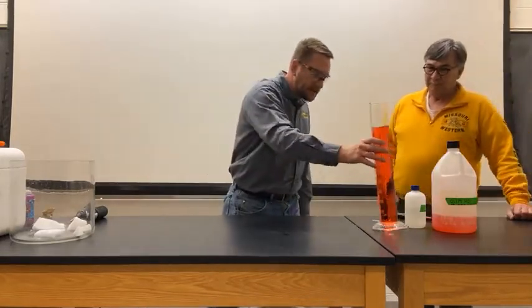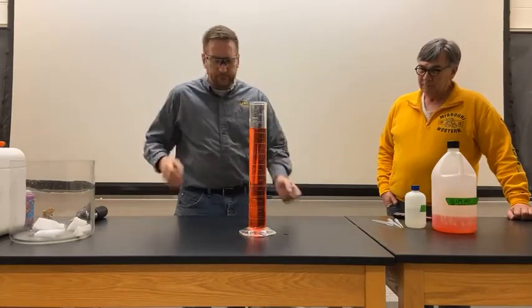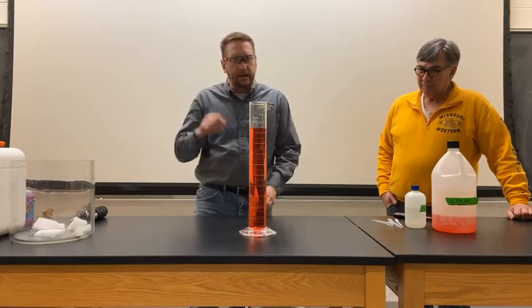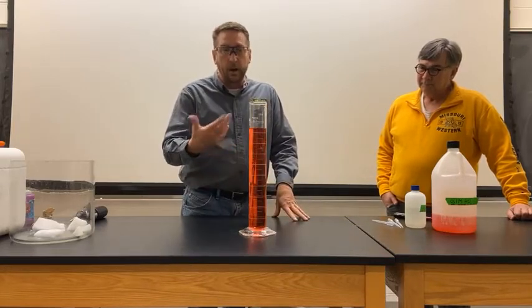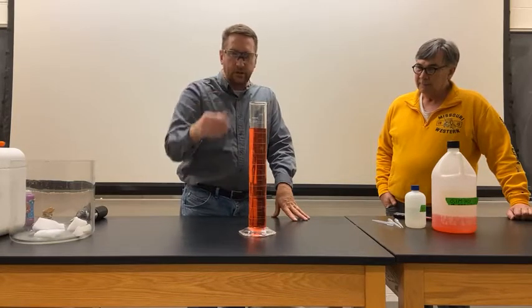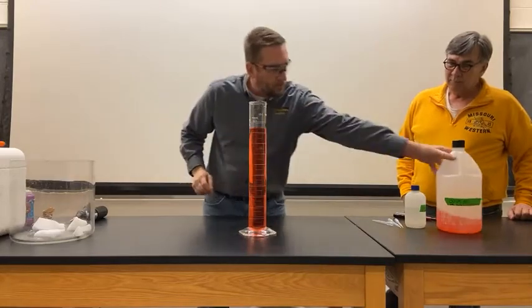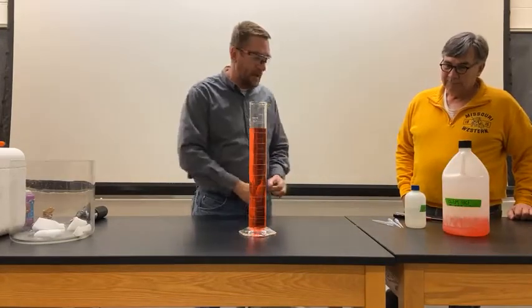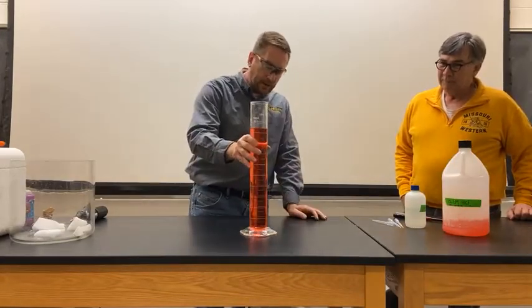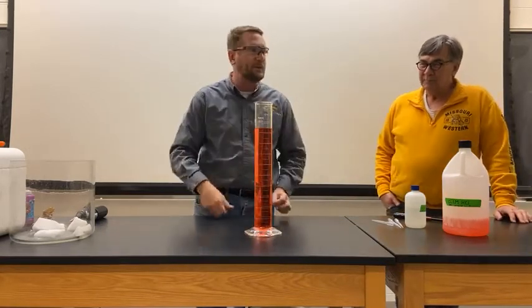So one of the things that I wanted to show you was the effect of dissolved carbon dioxide on some water. Now what I have here is a really dilute solution of hydrochloric acid. It's about 0.1 molar for my chemist folks out there. And it's red, by the way, I should share that, because I put some universal indicator in there.